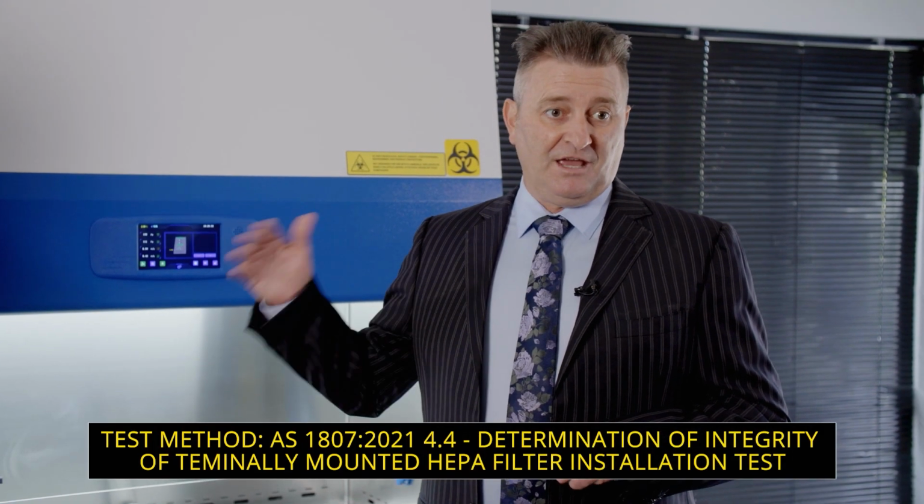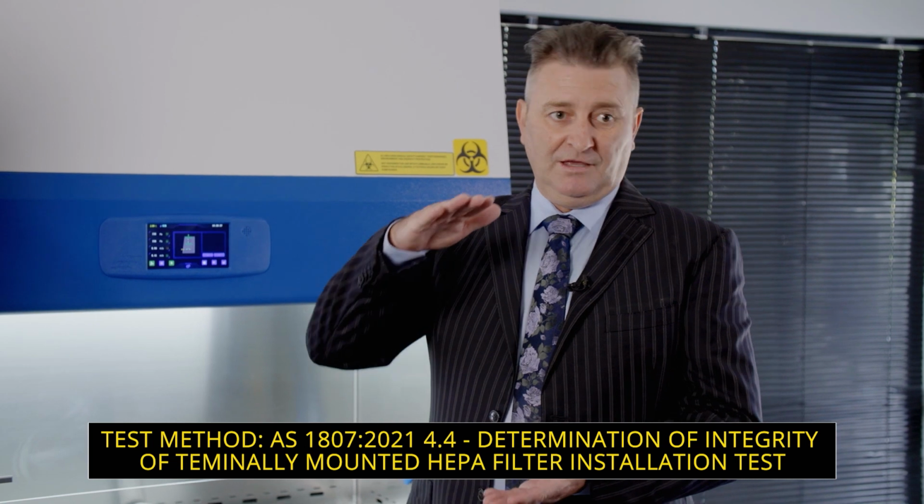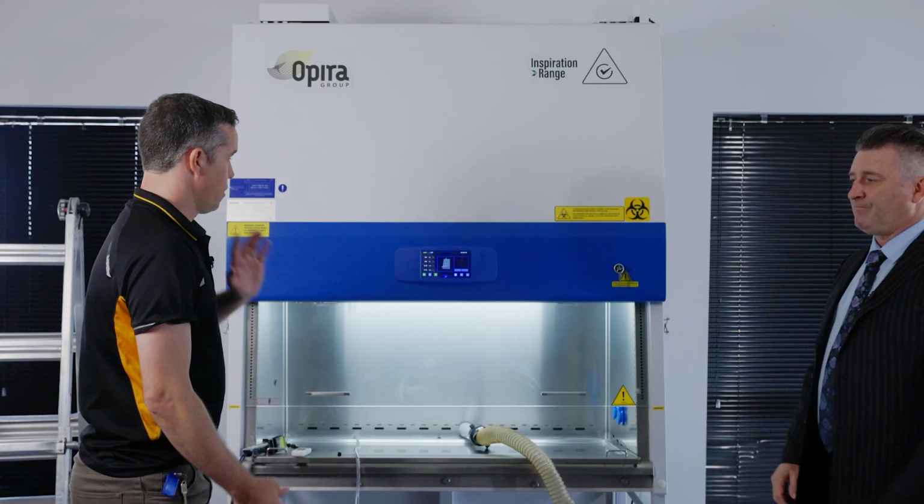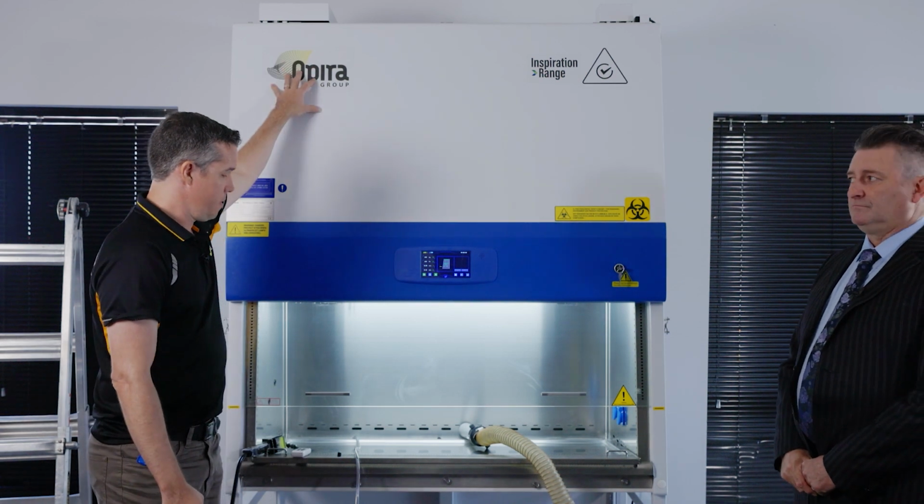We're going to move on to the second test that we do, which is the HEPA filter integrity test for the laminar flow and the exhaust HEPA filter. Curtis, run us through it. So we're testing the laminar flow and exhaust HEPA filter.